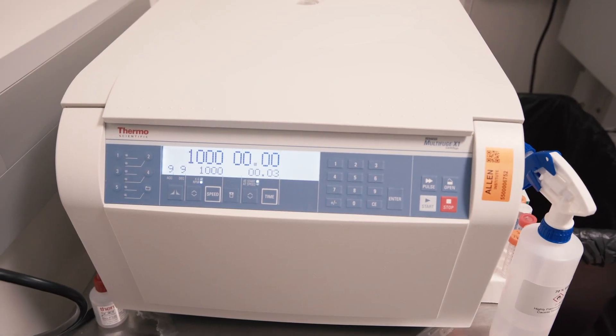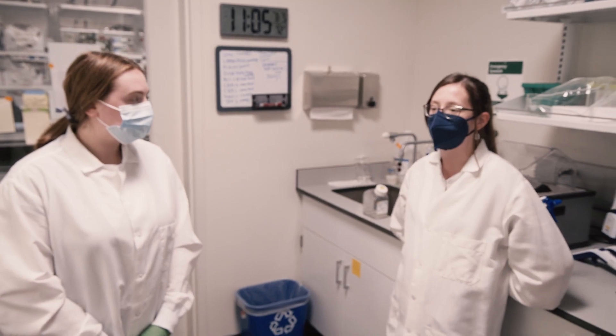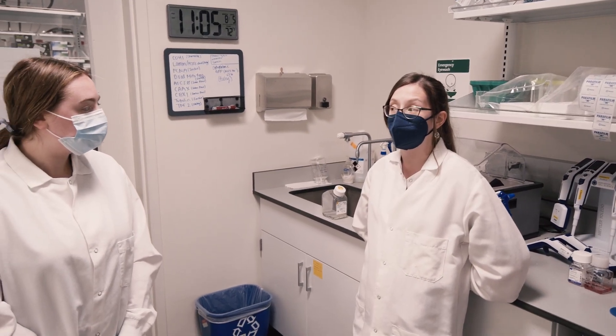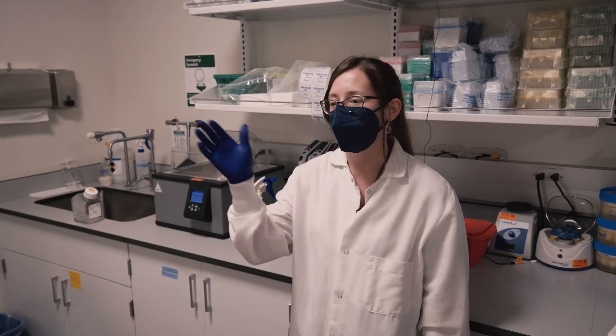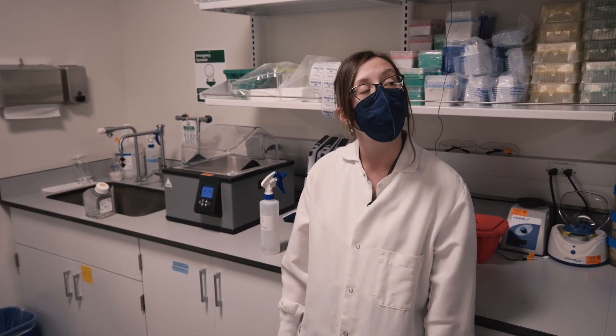That's spinning down at a thousand rotations per minute, which is going to push all of your cells down into the bottom of the tube. Cells need certain sugars, growth factors, and stuff like that, so we actually have to feed them every day. Haley's basically just re-suspending in that media we were just talking about, and then she'll plate it on the plate.